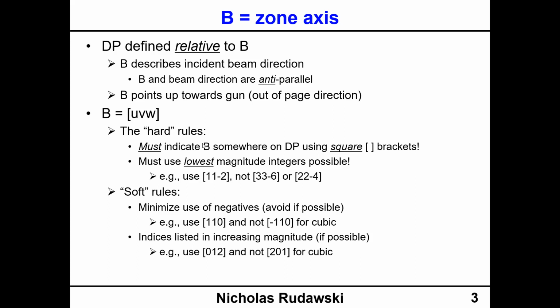And then we also have a very nice parallelism, okay? So because the material is cubic, the G HKL reciprocal space vector is always going to be parallel to the HKL real space direction, okay? So this makes it very easy to apply the different rules and to rearrange indices because we have this nice parallelism, okay? Because we're dealing with a cubic crystal.